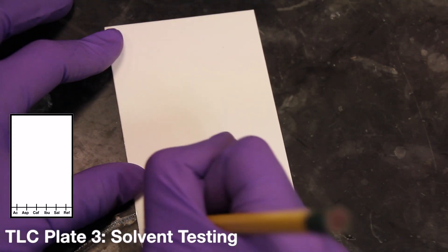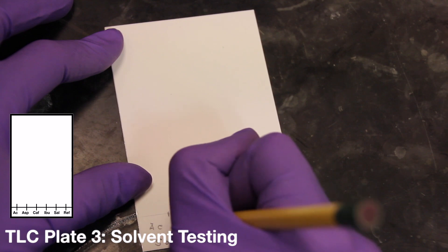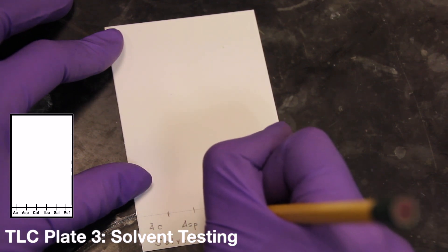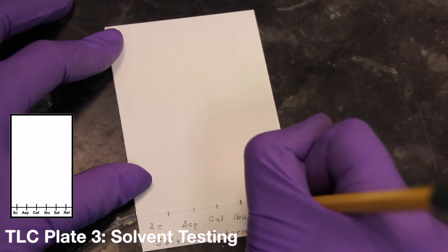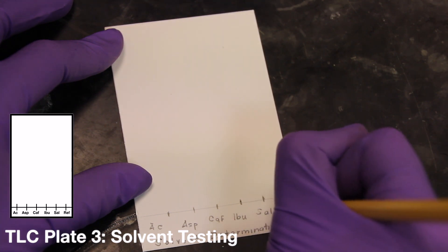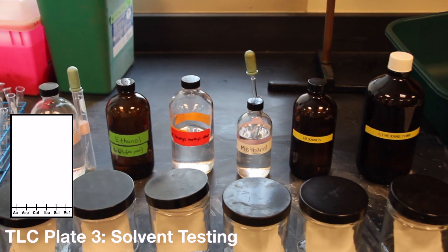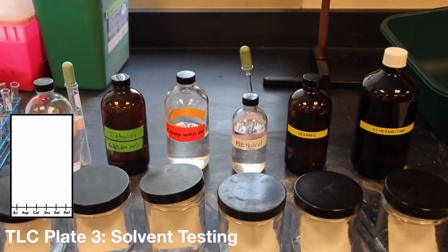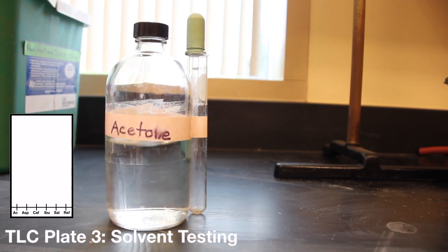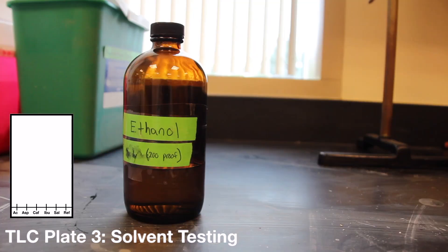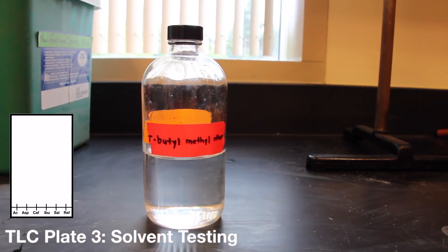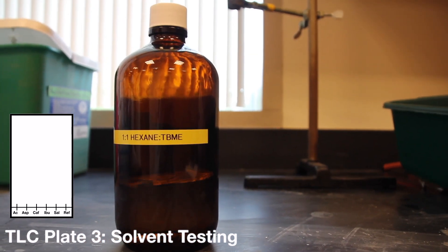Finally, the third TLC plate will be part of a group project whose aim is to compare TLC solvents. Each member of the group should spot a separate plate with 5 individual reference compounds as per plate 1. The group should test the following 6 solvents to see the effect of polarity on the TLC results: acetone, hexanes, methanol, ethanol, t-butyl methyl ether, and a hexanes t-butyl methyl ether mixture.